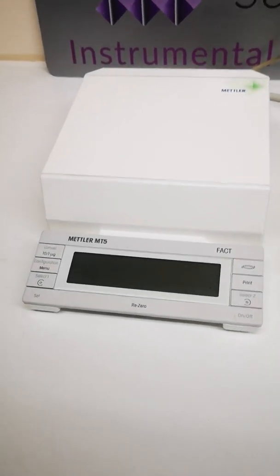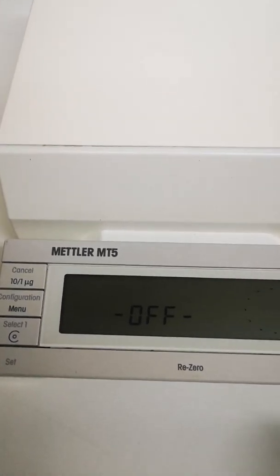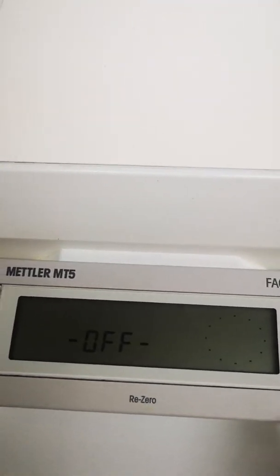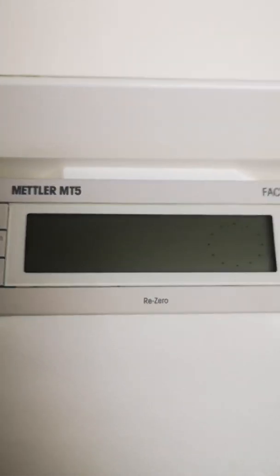This is the Mettler MT5 balance. What we're going to do is switch it on — you can see that it just moved, so it's now powered on.